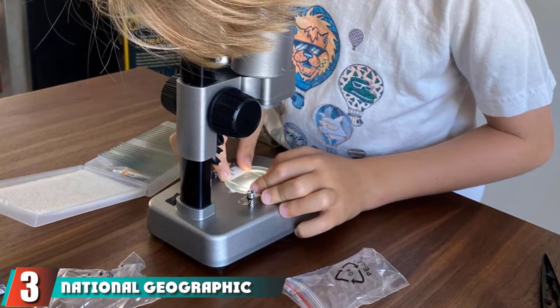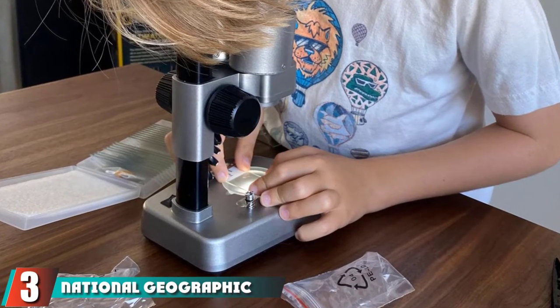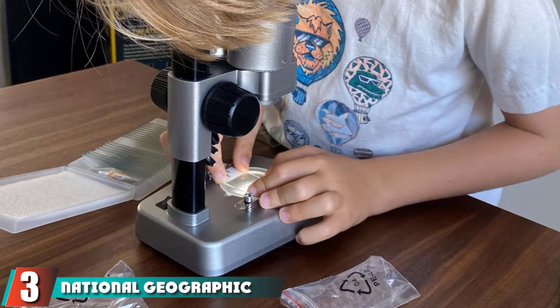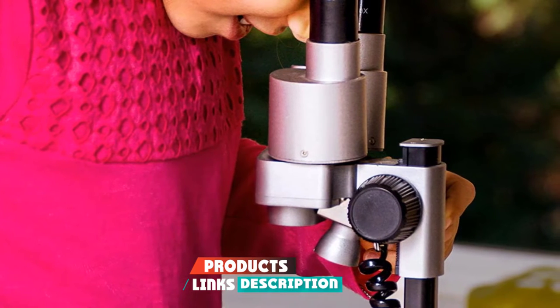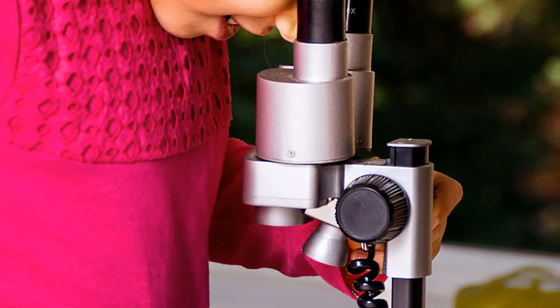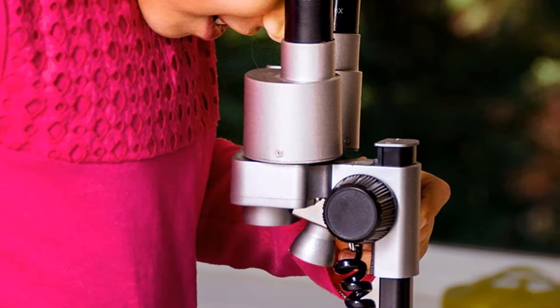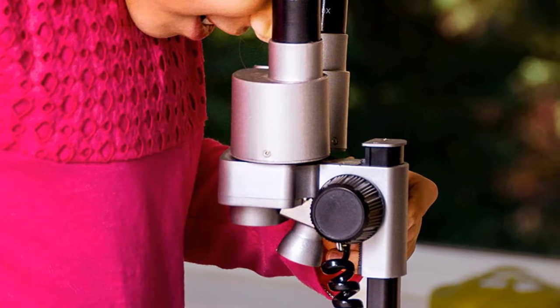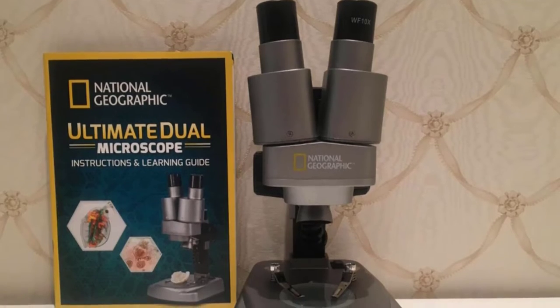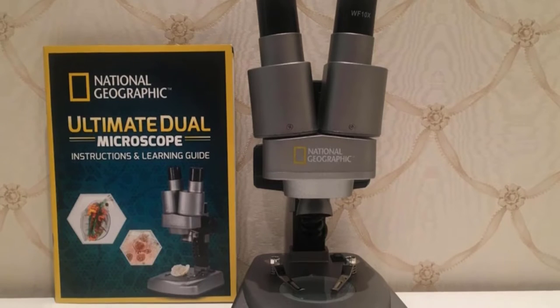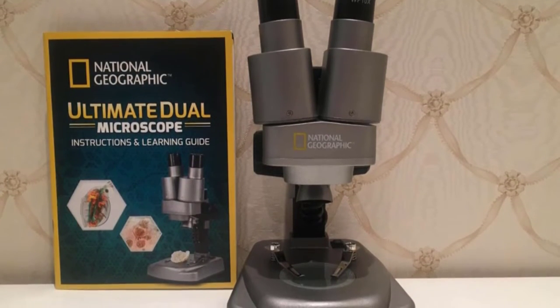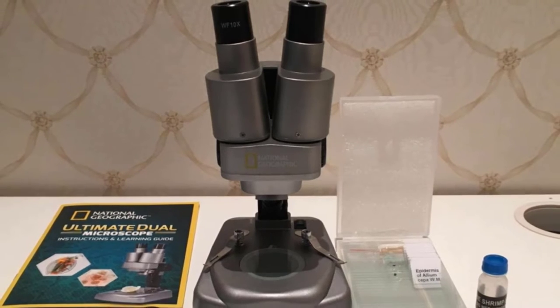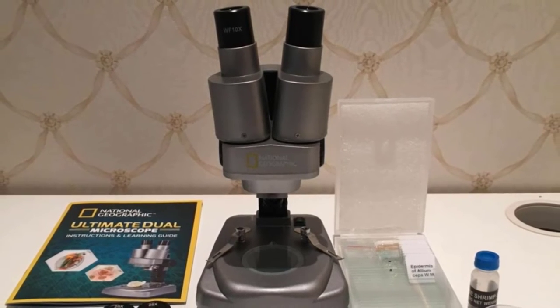The number three position is held by National Geographic Dual LED Microscope. Advanced science students typically use microscopes with two ocular lenses. Nat Geo's offering is the best kids' microscope if you want to mimic that same vibe. This microscope for kids has a design architecture similar to that of a real microscope. What makes it better is the adjustable distance between the eyepiece to avoid eye strain. The eyepiece is interchangeable between 10x and 25x while the objective remains as is at 20x.